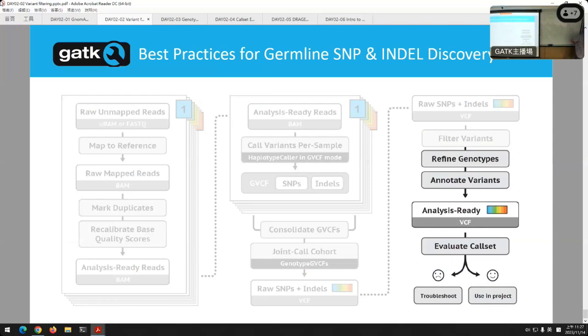It could be different in maybe one sample, but it's definitely not in general. Show me, we can look at it afterwards. I think the 2D model is definitely more accurate, and you can learn a lot more features from it. But it is also really, really painfully slow, so we don't really use it much.